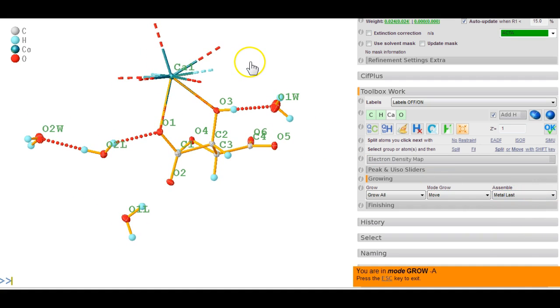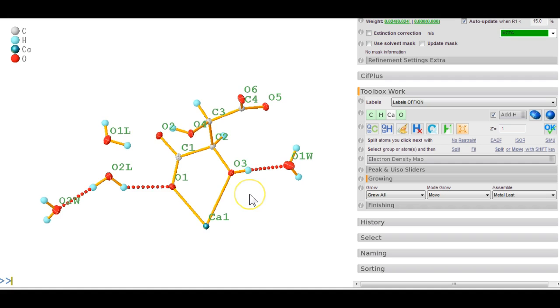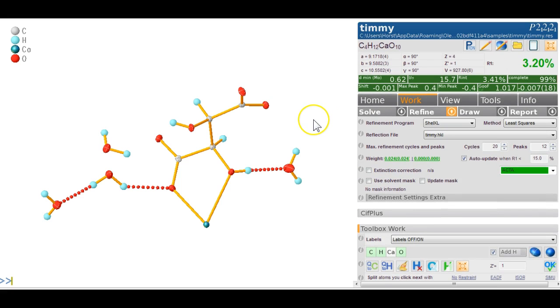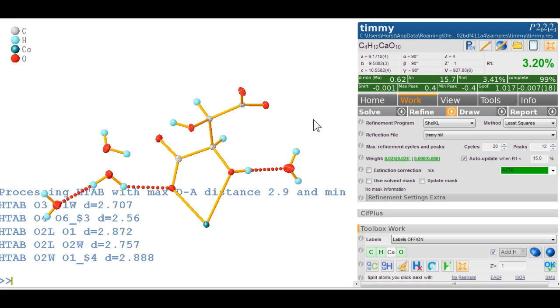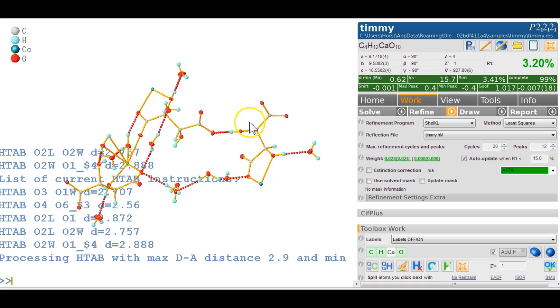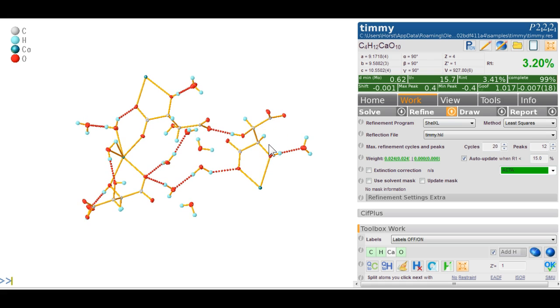Another thing you might want to do—F3 again to switch those labels off—is explore what we've got in terms of hydrogen bonding. One way is h tab. This finds hydrogen bonds by default with a maximum DA distance of 2.9 and a minimum angle of 120 degrees. H tab minus g will actually show you each of those hydrogen bonds at least once.